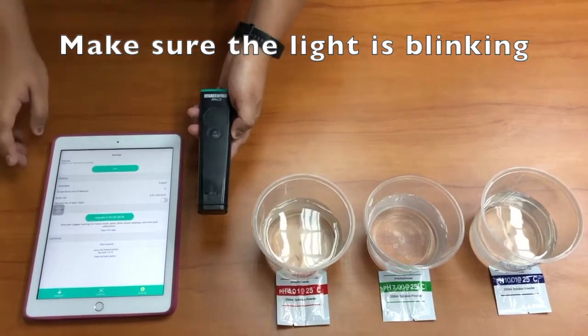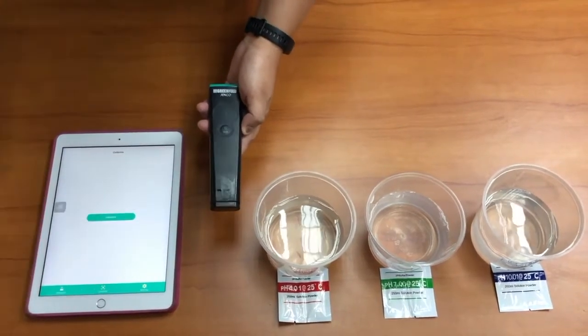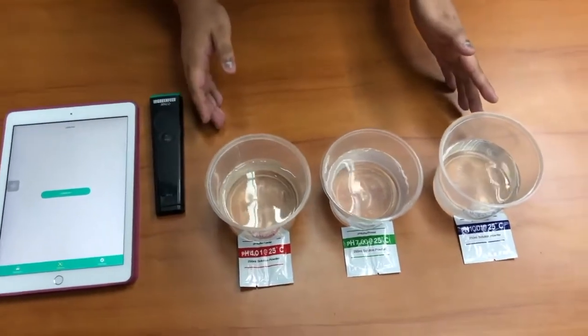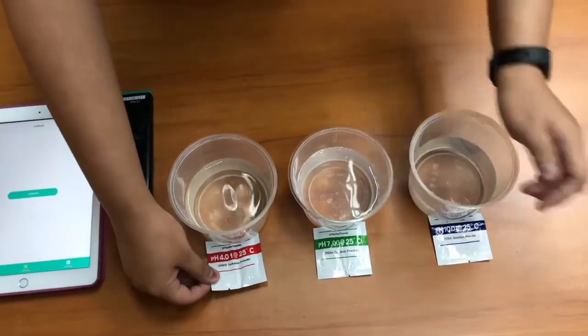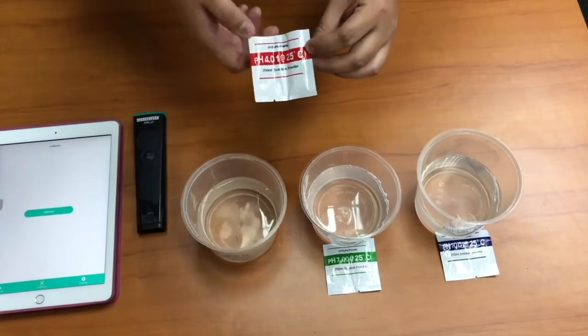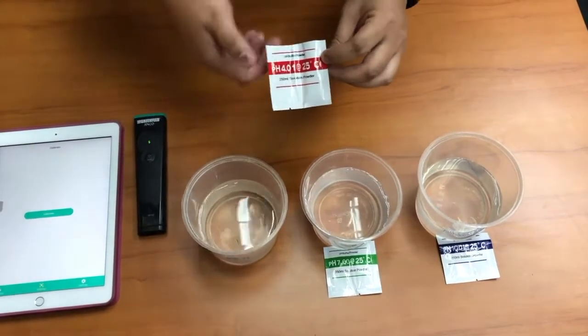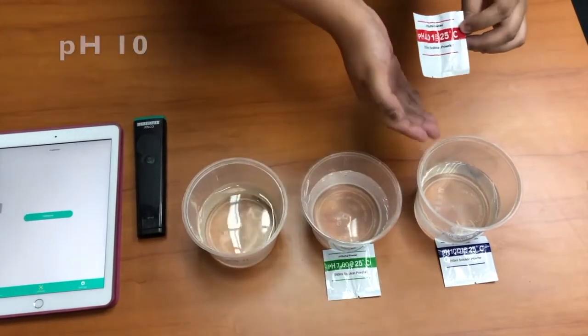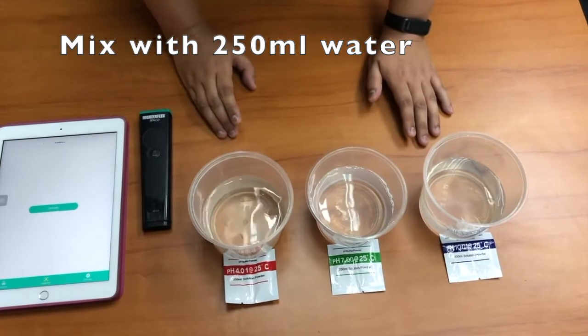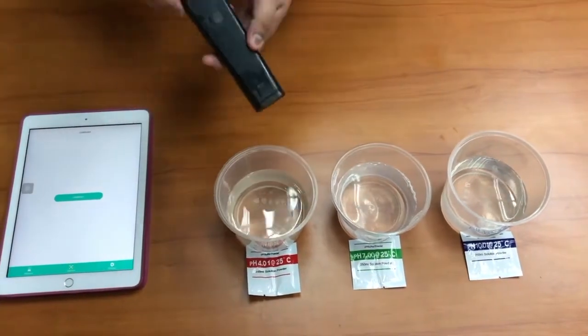Now before we calibrate, we have to make these three solutions. These solution powders, which are pH buffer powders, are provided by Jenco in the form of pH4, pH7, and pH10. We have pre-mixed them in 250ml solution water. Now we want to calibrate this pH meter.